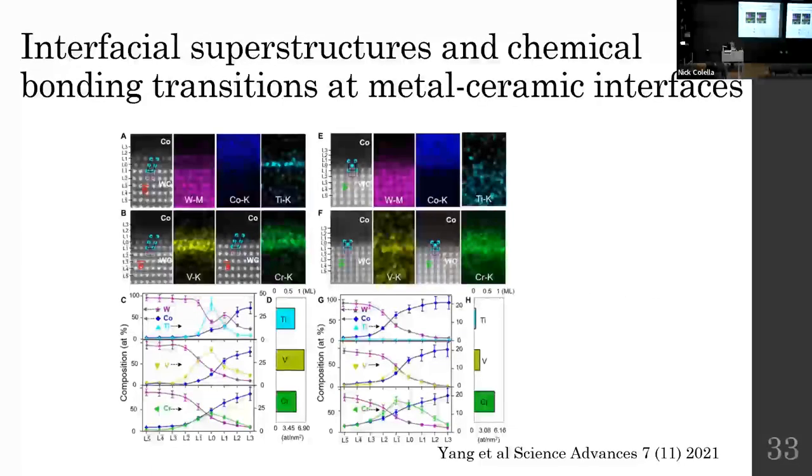For example, this is kind of the highest resolution EDS you can do. You can actually see individual atoms. There's no way Tim could do that on an SEM. So in a TEM, if your microscope is behaving and you have the right detection, then in some cases you can even detect what elements are coming from which atom in the image. I think this is kind of impressive. So that gives you an idea of what length scale you can go down to. More typically, people are using this for nanoparticles on the 10 to 100 nanometer scale in our labs. But this is actually possible in some cases.